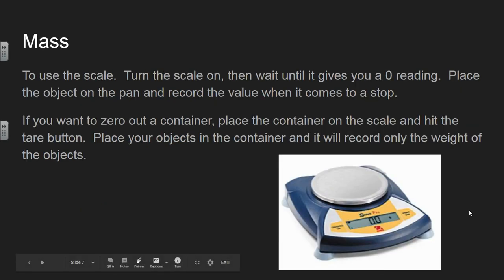Now, the one that's easiest to measure is mass, the mass of an object. To measure the mass of an object, we basically can just put it on a scale. The scale has an on off button, we turn that on, we wait for it, it normally takes a little while to calibrate. Once it gives us a zero measurement, we place the object on top of it, wait for the mass to actually stop moving, and then we record that value. You do not have to worry about estimating a place on a scale, because the scale actually automatically just estimates it for you, that last spot, it rounds it in the computer before telling you what shows up on the screen.